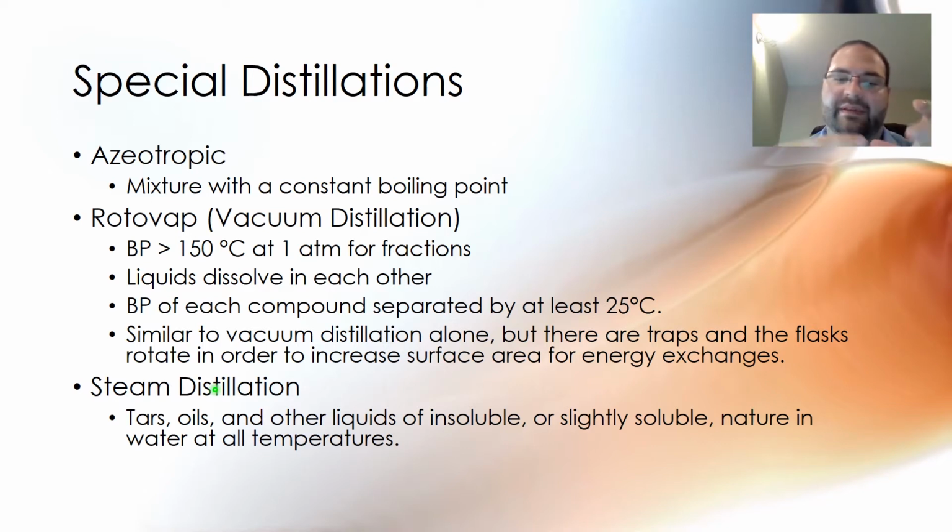So generally, most rotovaps, you've got a water bath, you've got some water in it, you can heat up that water, you can increase the temperature, you can get it up to around 150, pretty good. Much beyond that, though, would be kind of hard to do without a lot of energy. But you could possibly come up with something like that.